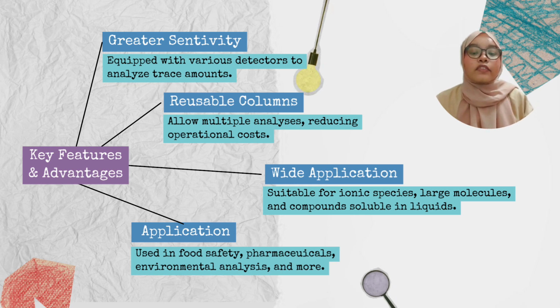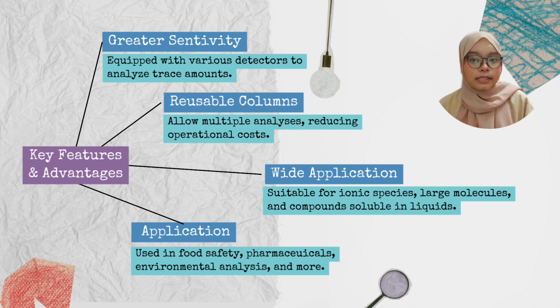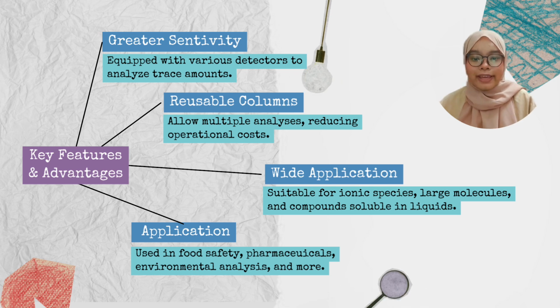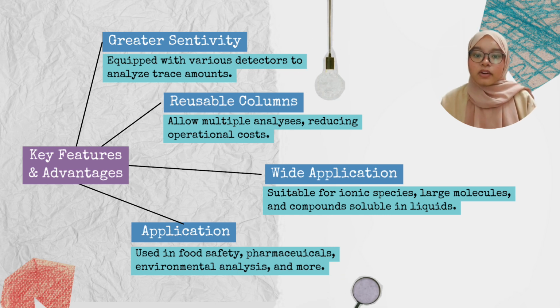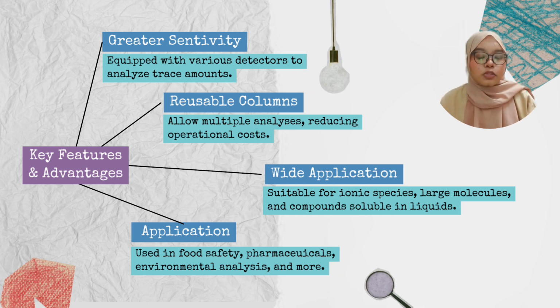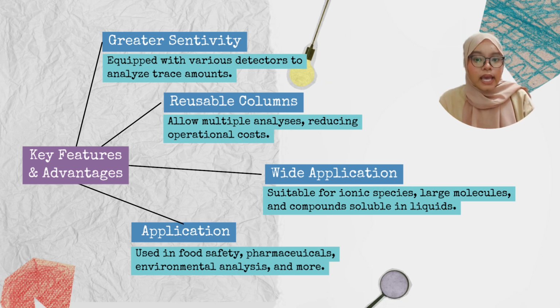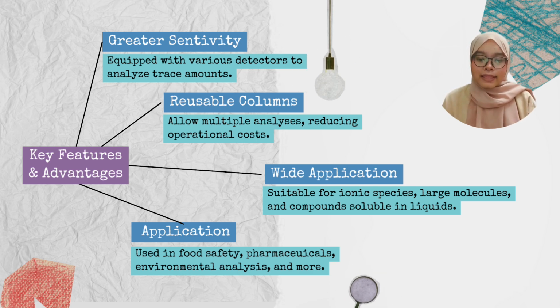Next, we have reusable columns. This allows multiple analyses, which significantly reduces operational costs. It's both efficient and cost-effective. Next, HPLC offers a wide application range. It's suitable for analyzing ionic species, large molecules, and compounds that are soluble in liquid. This versatility is one of its standout advantages.